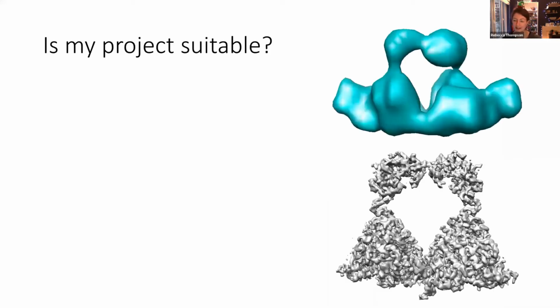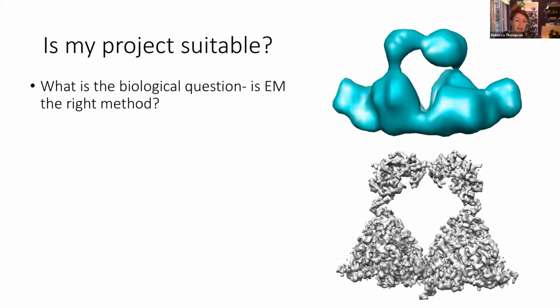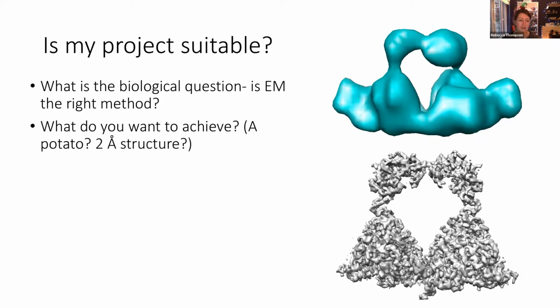Well, that really depends. So there's lots and lots of questions here, and I'm going to just run through a couple of key points. So the first one is: is electron microscopy the right method for the biological question that I want to answer? And we'll come back to this one a little bit as we go through.